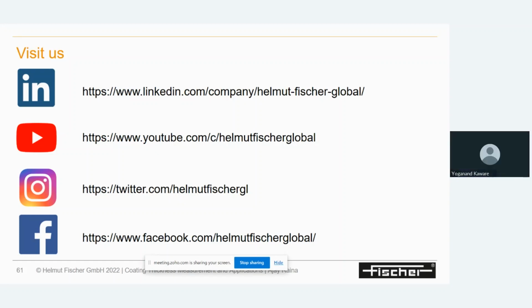Yeah, that's why I'm saying we need to know which model he is using. If it is a top to bottom model, we have to place the cell upside down. If it is a bottom side instrument, then we have to place it from the bottom side down. We have the SOPs and the videos for running the bath solution analysis. We can share them with the customer, or he can directly get in touch with our service people. They can help him with how to do the solution bath analysis.